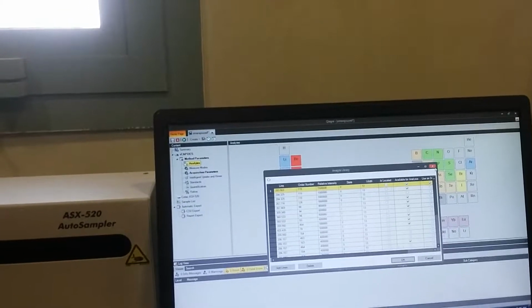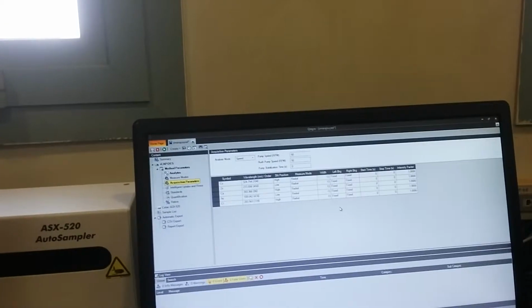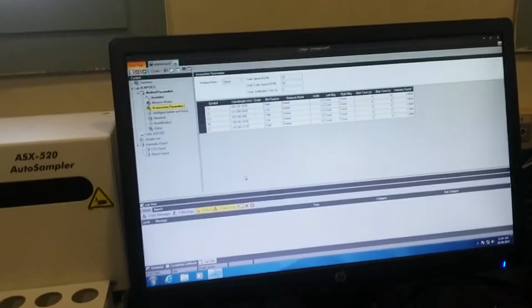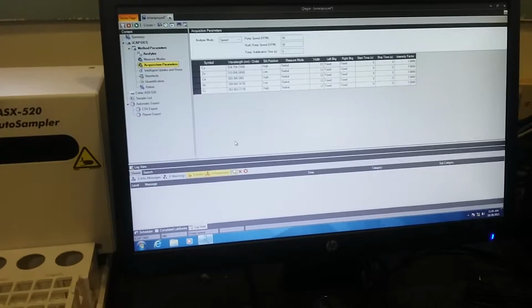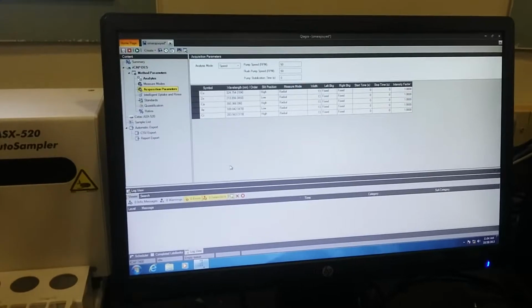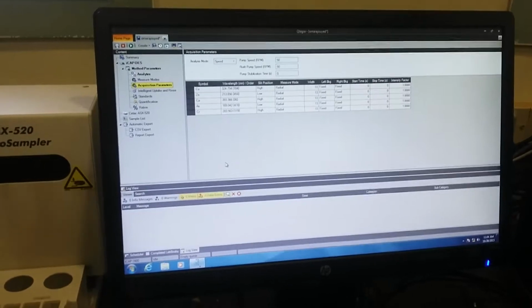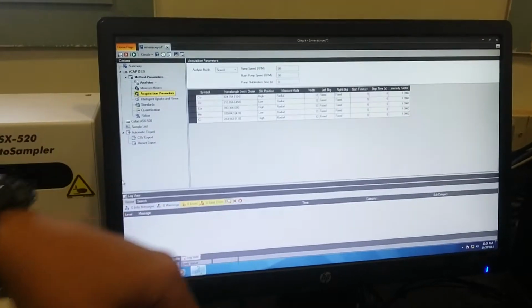So the other wavelengths may be isotopes, for example. But actually, the thing is, we don't have the application right now. Why are we selecting other wavelengths? It's because of the design of the instrument. It will scan all the lights, and sometimes because of interference, it could not see that particular element. So instead, it will use other lines and assign it as a different wavelength, but actually it's the same element.